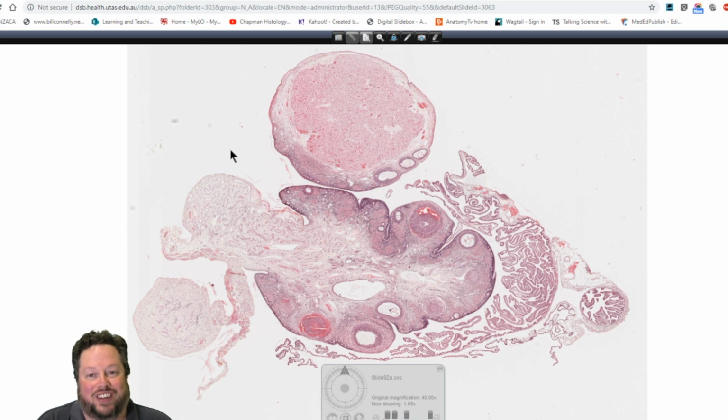This is an odd section, so I might start with another section. All right, we'll start here, okay? We'll start here. We'll move to a more normal section, and then we'll come back to this one and interpret it, because this one's a little bit complicated.